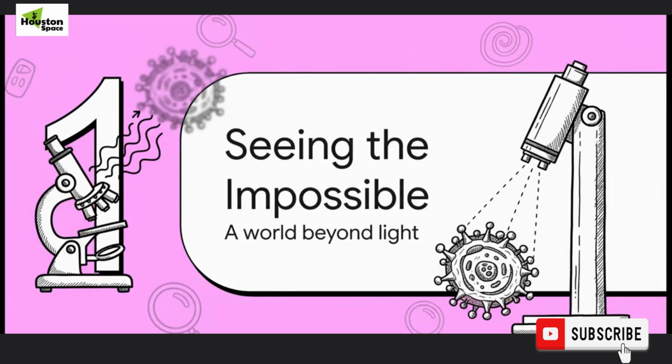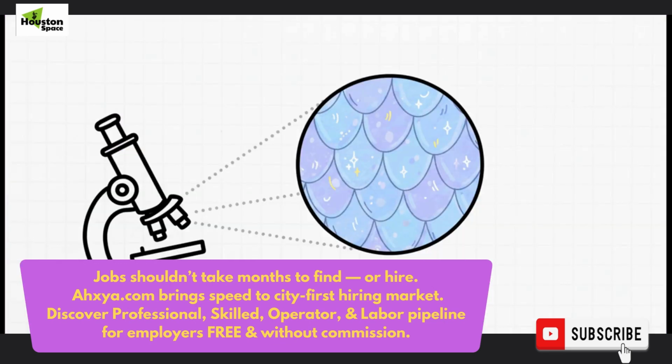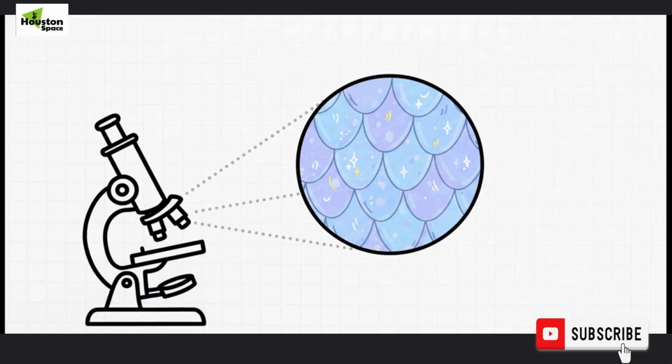And to really get a feel for their power, let's start with a little comparison. This is going to show you just how much of a hidden world they can actually reveal. Okay, so if you take a standard light microscope, the kind you probably used in high school science class, a butterfly wing looks like this. You can see it's made of these tiny overlapping scales. Pretty cool, but this is pretty much the limit. This is as close as light can get us.